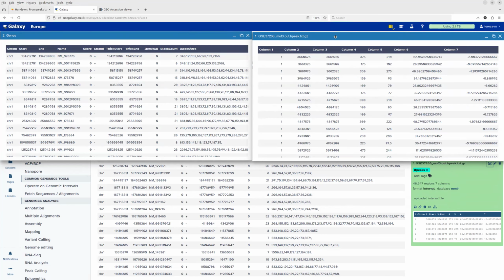the content of the files. So you see the first column both holds the chromosome, but we have for the genes file chr1, and in the interval file we only have one. Then the next columns are the positions, which seem to be similar.